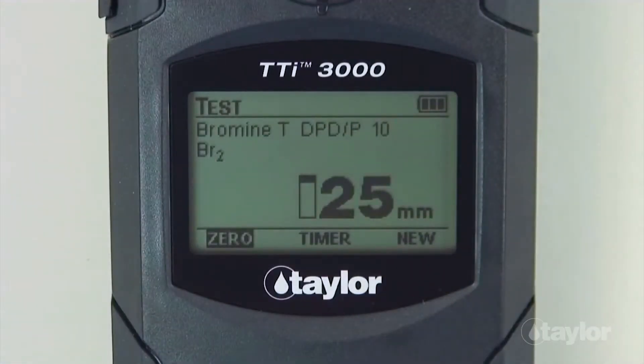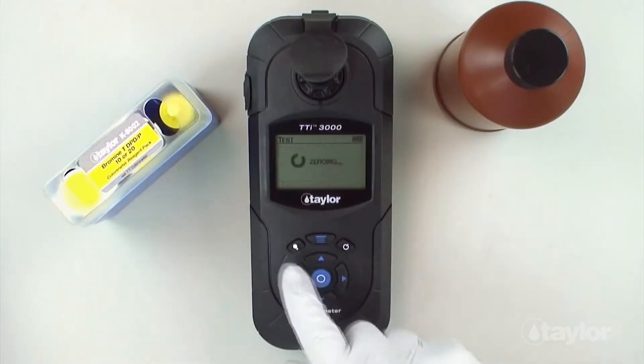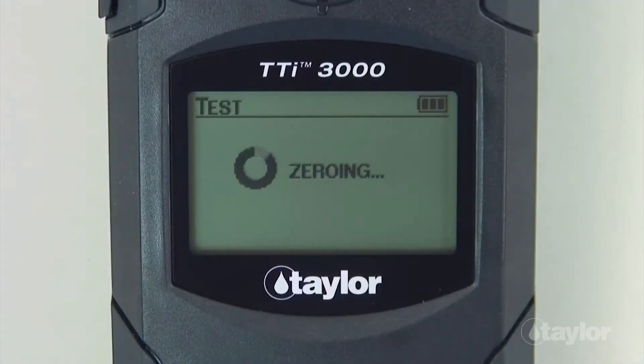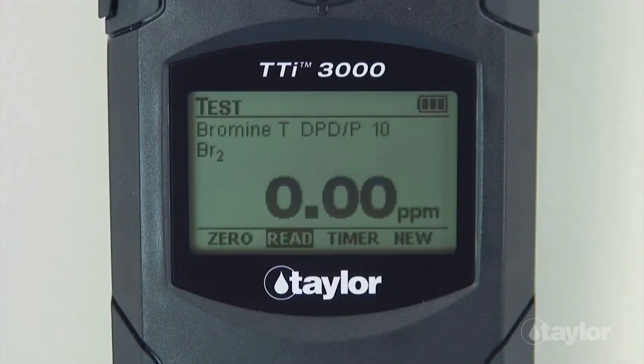Select zero using the scroll arrows, then press enter. Zero will be displayed on the screen.